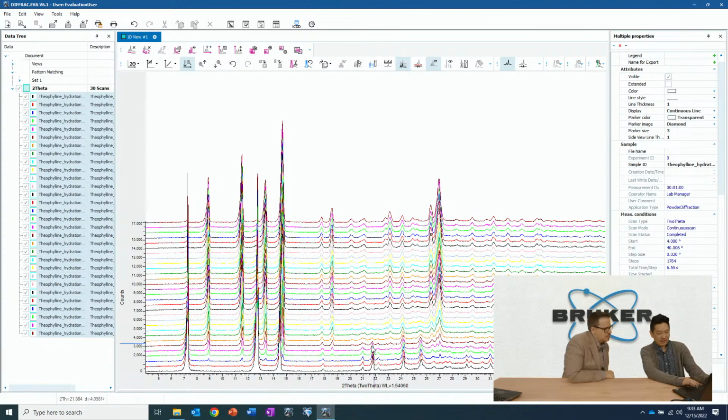Right. So this set of peaks down here, this is gone after say number 6 or 7 or something like that. Again, these come away 6 or 7. These peaks start to come in kind of rapidly, right?